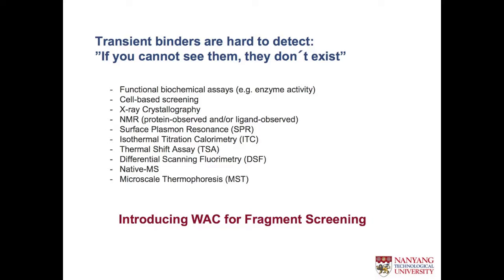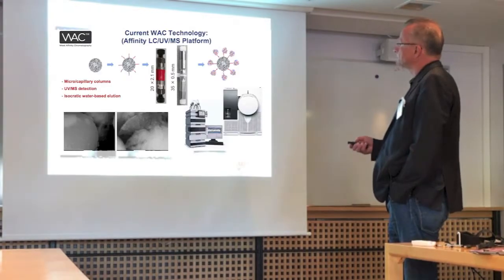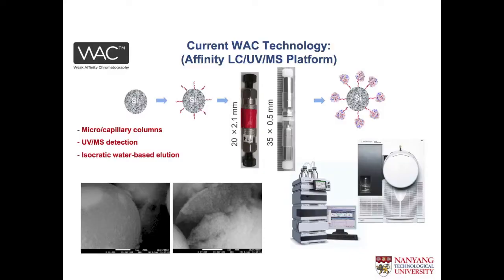I mean, we have SPR. SPR is a very powerful technology, and a lot of people are working with it. There are a number of other assays, as you can see. I'm not going to go into the details. So we started with that situation, and here is the current technology.